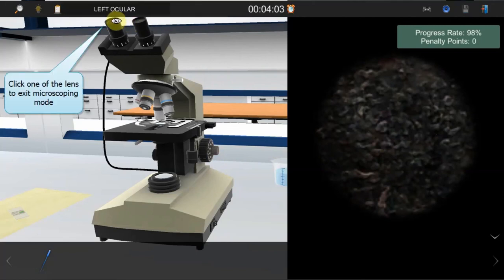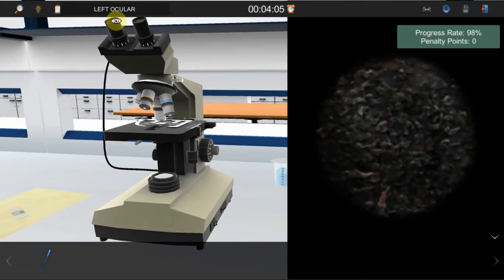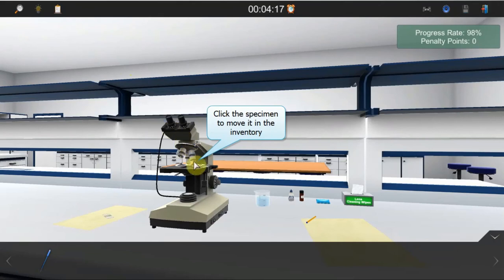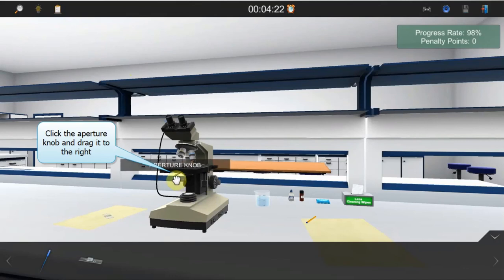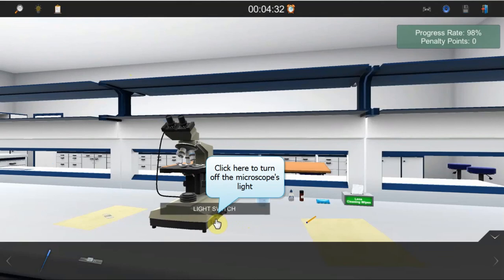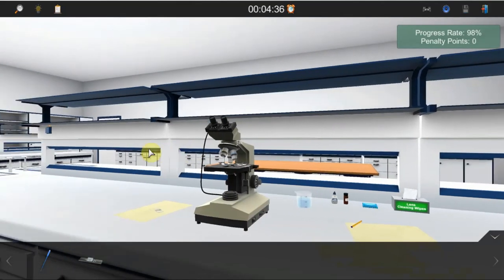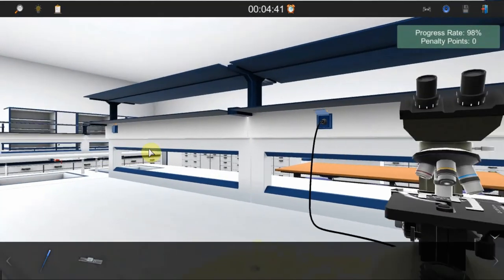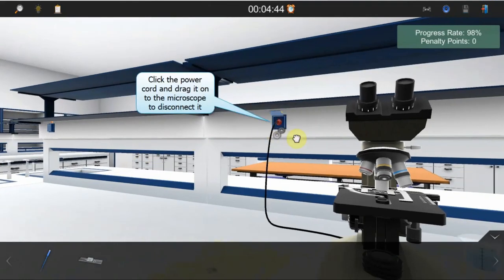Exit the microscoping mode by left-clicking on the glass of the ocular and reset the microscope to its initial state. Click on the test specimen to move it into the inventory. Rotate the iris knob to the right-most position. Set the light intensity to 1 by rotating it to the left. Turn off the light of the microscope. Disconnect the power cord from the socket.